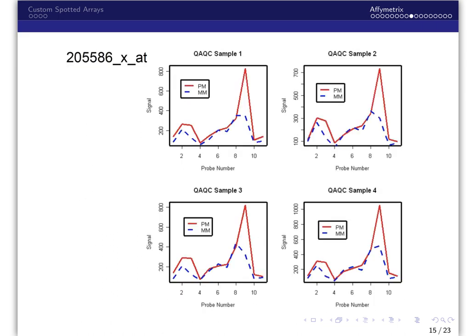It has been observed that the variation of a specific probe within a probe set across multiple gene chips could be considerably smaller than the variance across the entire probe set. In fact, on the log-base 2 scale, the between array standard deviation is in general 5 times smaller than the within probe set standard deviation. This figure demonstrates this artifact for a specific probe set in a set of 4 technical replicate gene chips.